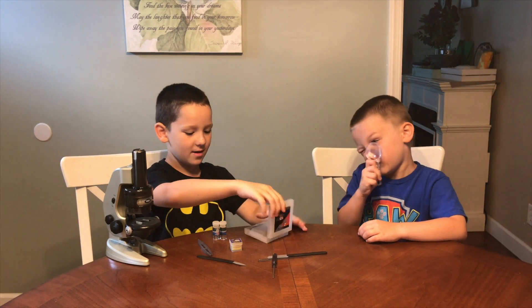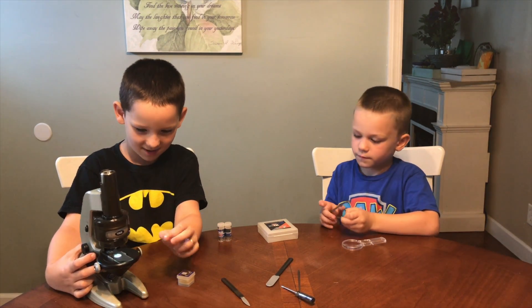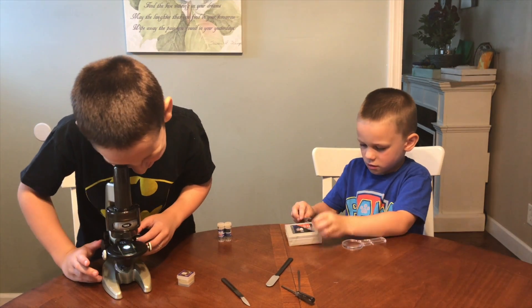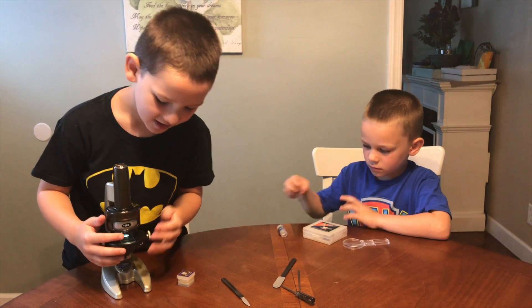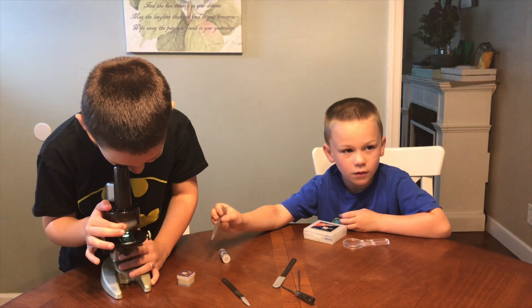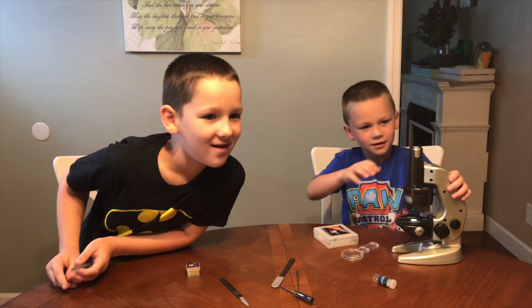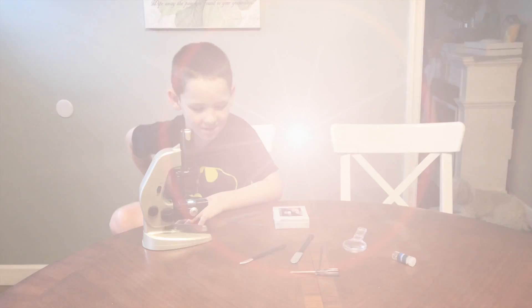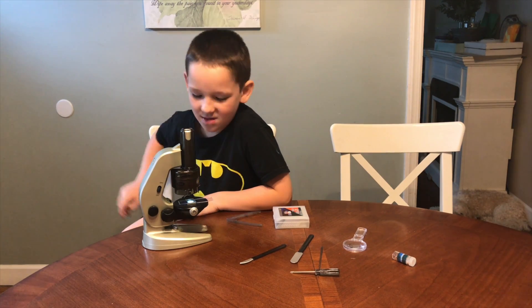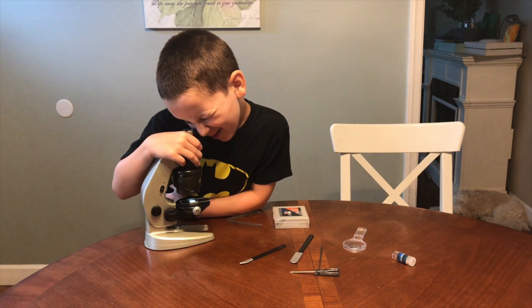For now we're going to look at the prepared slide. First slide is hydrilla. What you have to do is take this and make it good enough for the slide and then just adjust it to focus. You can change the magnification too. Oh, look at all those particles! I took a little piece of tissue off the floor, then took the two glass parts, put the tissue in between the glass parts, and it looks very, very cool.